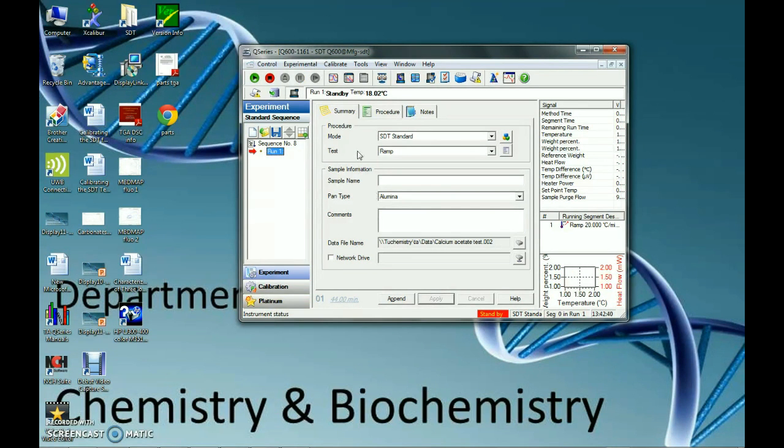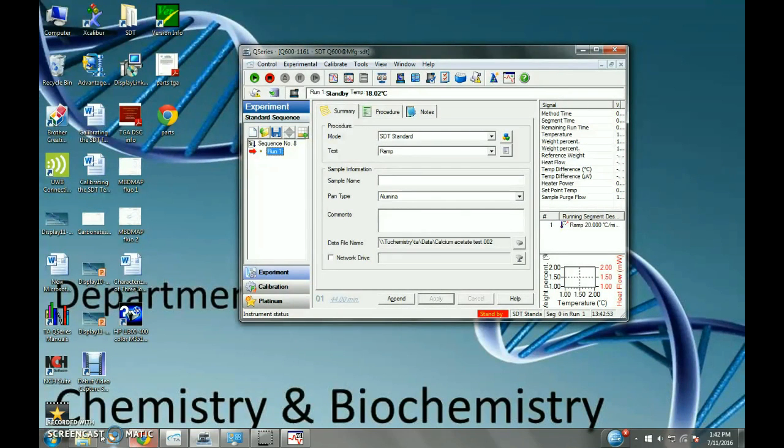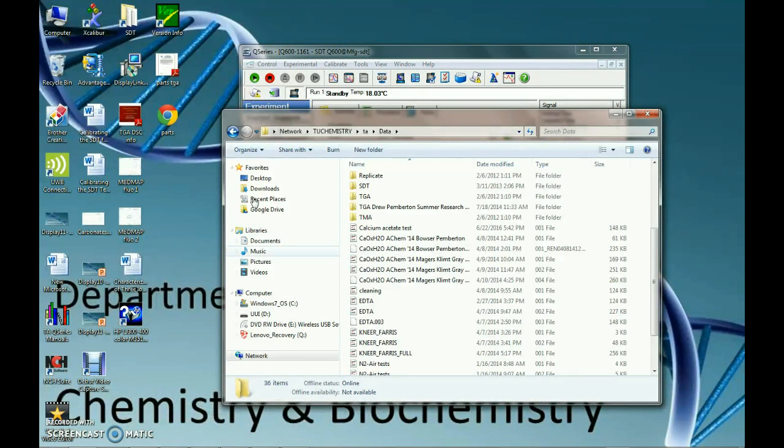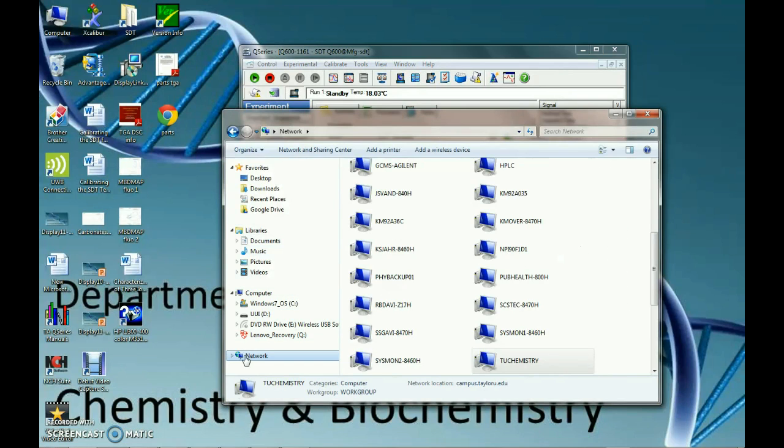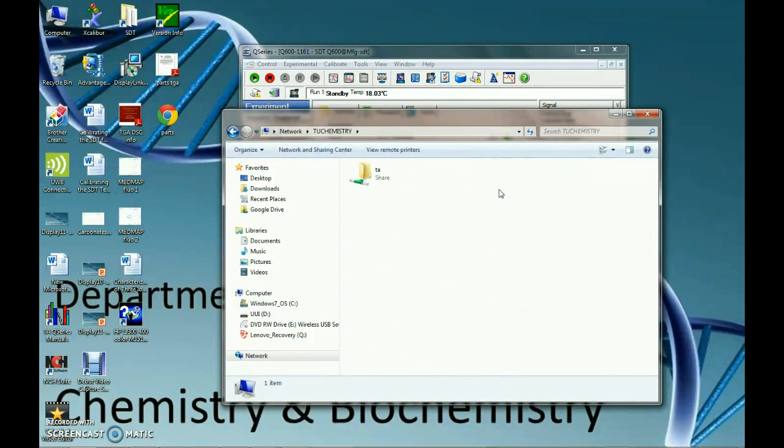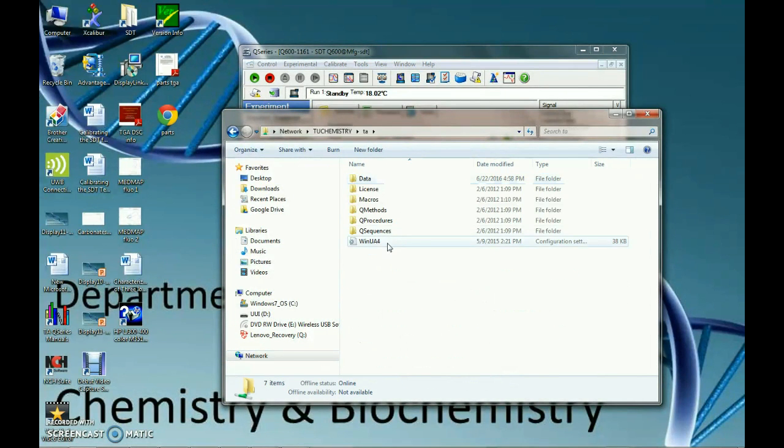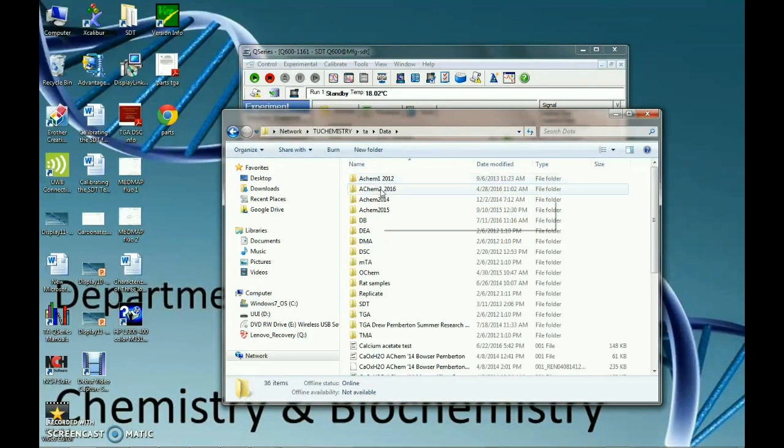So now that the run is finished, we can go ahead and look at our experiment data. Let's go ahead and open up the file folder here and go down to network, to chemistry, TA, and into data. So here's our experiment file, calcium acetate test.